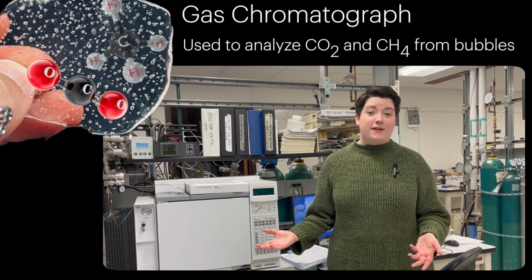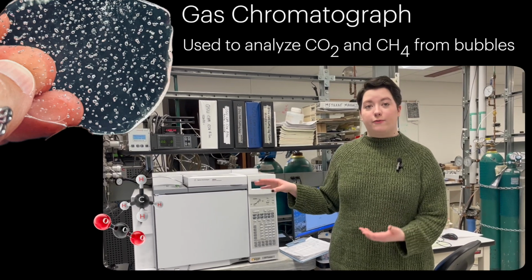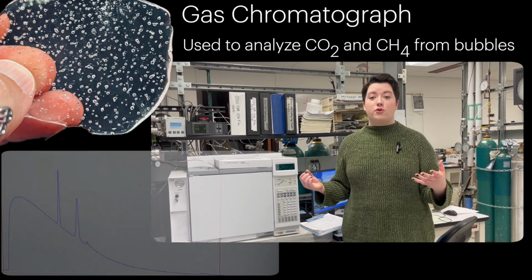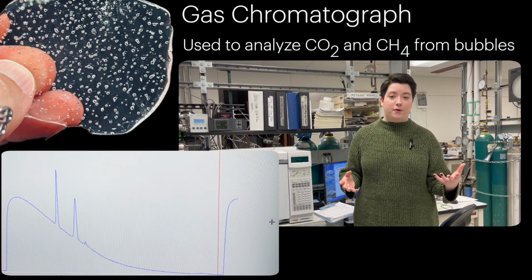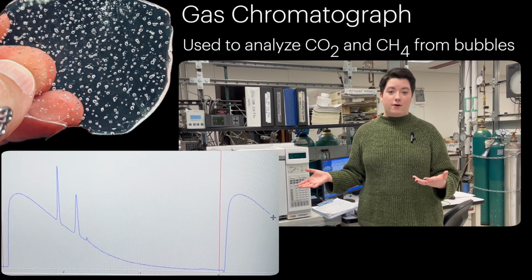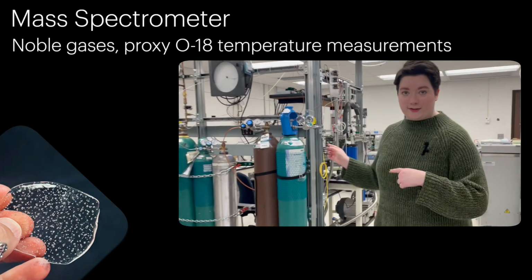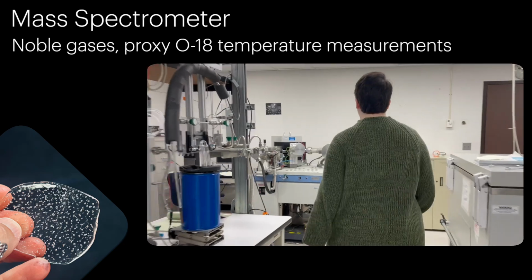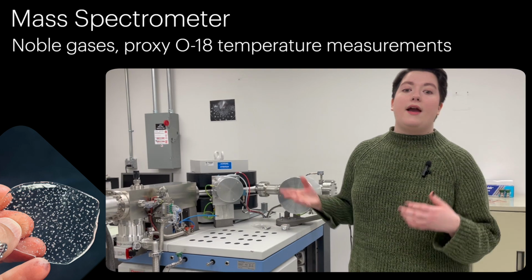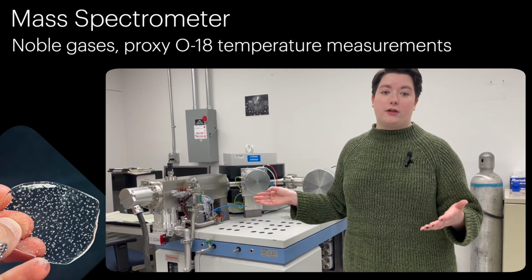On both the CO2 and methane extraction lines, the air that we extract is passed to this instrument called a gas chromatograph, or GC. Inside the GC, the air is heated up, passed through a narrow tube that separates the different molecules within the sample, and measured at the other end. That tells us the concentration of the different gases we want to measure. For some other measurements like noble gases, we use a mass spectrometer, like this one here. Inside the mass spectrometer, the instrument ionizes the gases, and it shoots them past a powerful magnet to split the different types of molecules apart from each other.